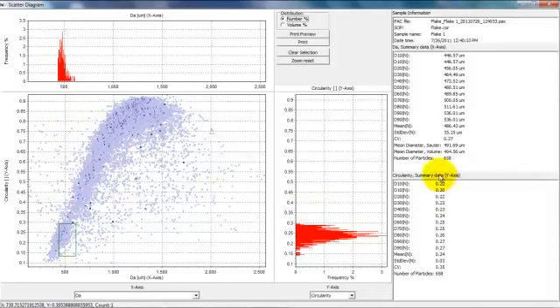And we see that now the mean volume diameter for DA is 494, the mean number diameter is 486, and for the circularity, the mean number is 0.24. And now we have only 658 particles represented here in these distributions, where before we had over 1,000.